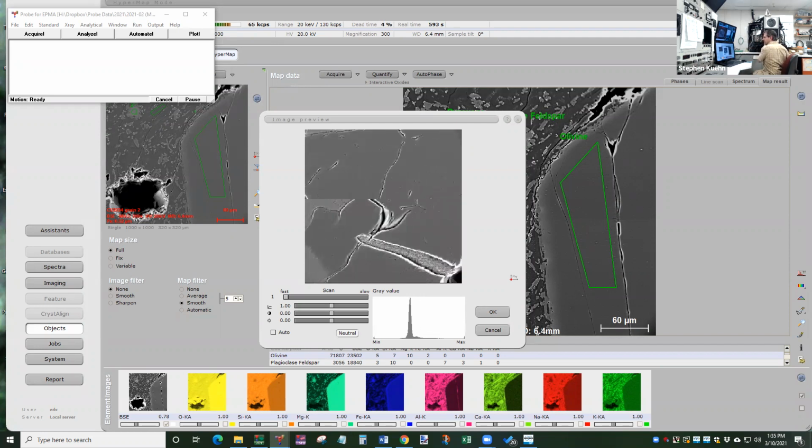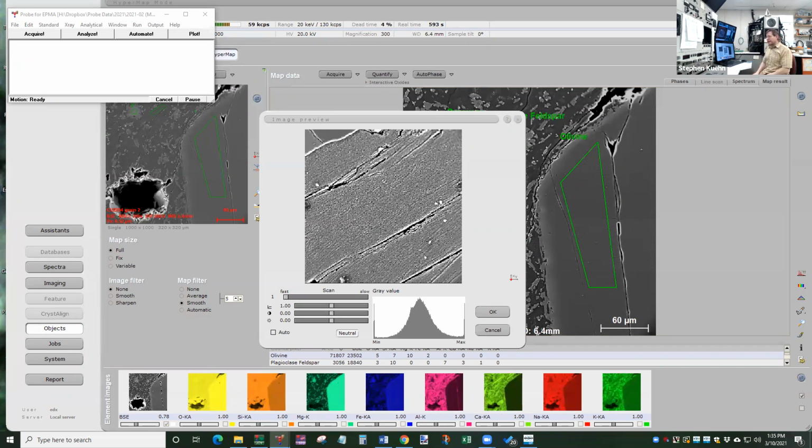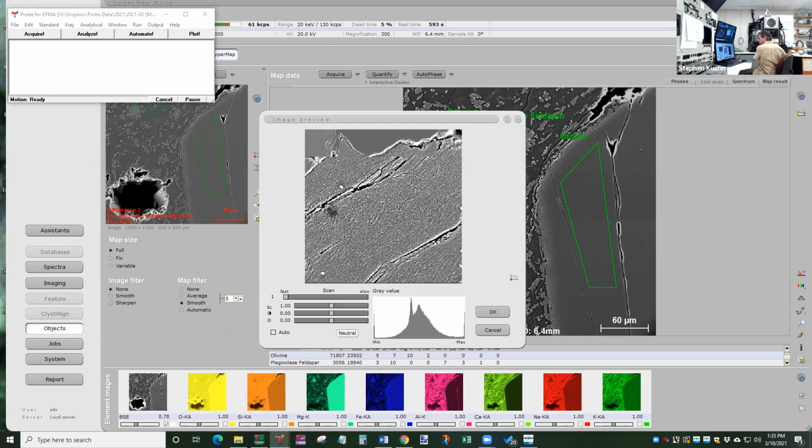We've got that, which is pretty big. And we got this one, which is another mineral, which is also really big. We don't have those tiny little things in there like the other rock did. So this rock is almost entirely big crystals. So that means it has a different texture. So we'll call that phaneritic or coarse.